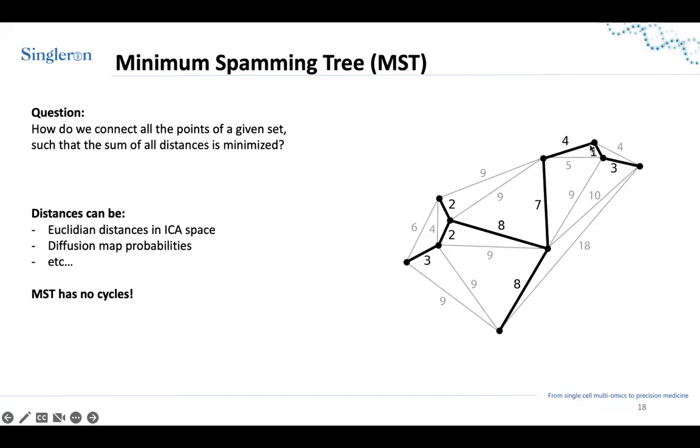And this indicates an estimation of the path that a cell would take if it had to differentiate. So if the cell starts here, it would go there, then there, then there, then follow this path, basically. So you see there is a branch here, there are 2 possibilities, and you have again a branch here with 2 possibilities.